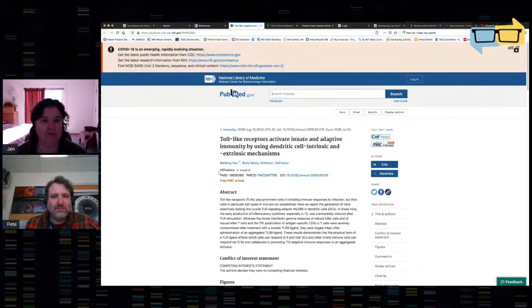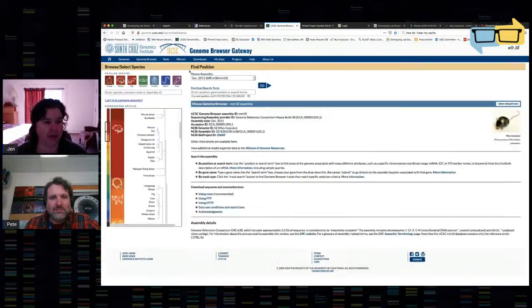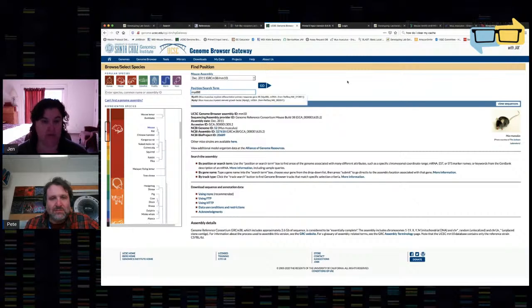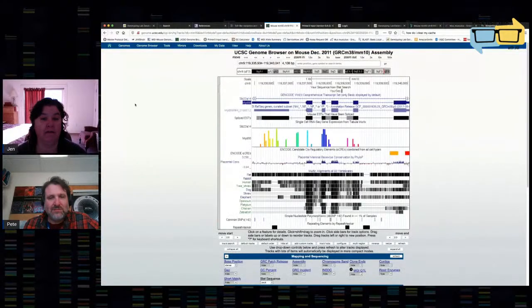One of my absolutely favorite websites is the UCSC genome browser. I'm going to click on genome browser — it automatically puts me on the mouse assembly, but you could look at human, mouse, rat, etc. I'm on the most recent mouse assembly. I'm going to enter my gene of interest, which is MYD88, and click the top link. MYD88 is located on chromosome 9, and what this will allow me to do is download the genomic sequence of MYD88.